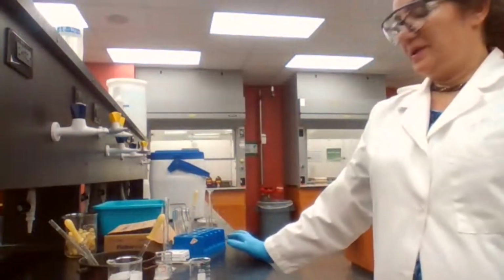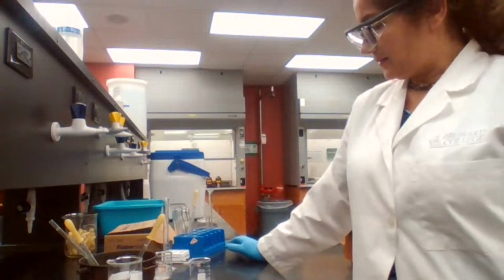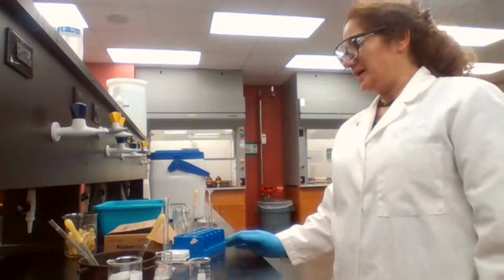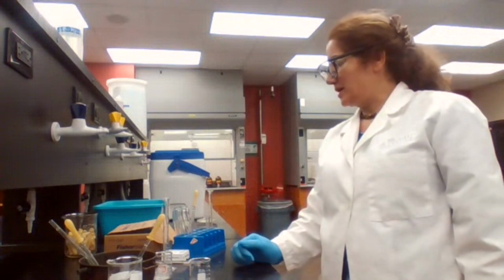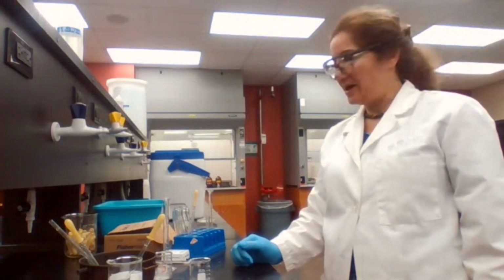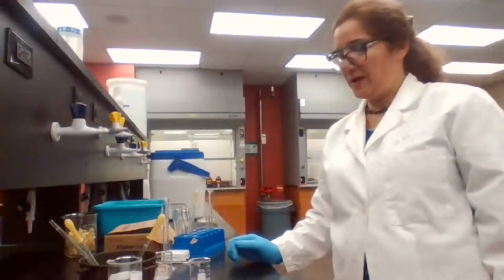Just waiting for the reaction to complete, and I still hope that we get the product, we get precipitate. And if we don't get precipitate, I'm not sure how we can prove this. We have to have a new bottle of nitric acid.